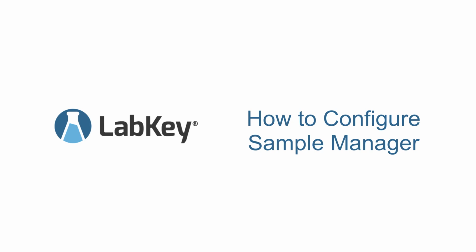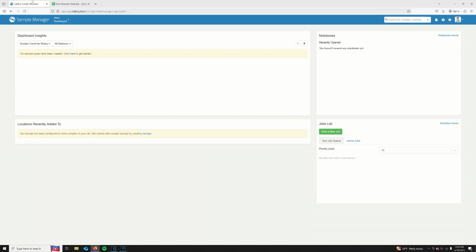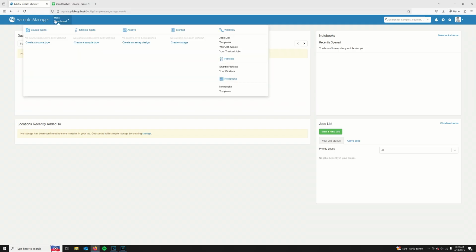This video will cover how to get a new Sample Manager instance configured. We'll cover how to understand your data, how to configure your sources, samples, and assay types, and setting up your storage units. Here, I'm in a brand new instance of Sample Manager. Right now, there aren't any data structures set up, and it's completely empty.